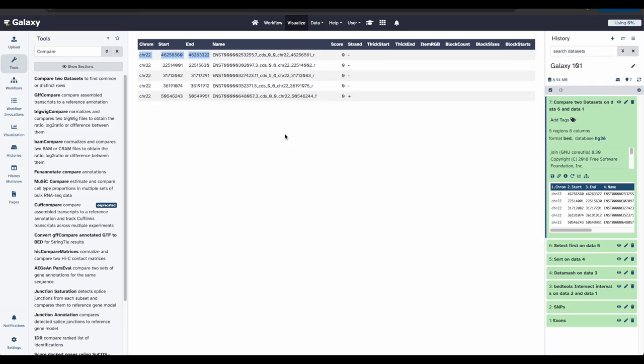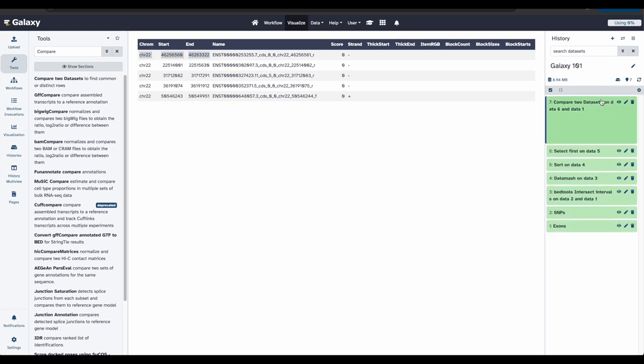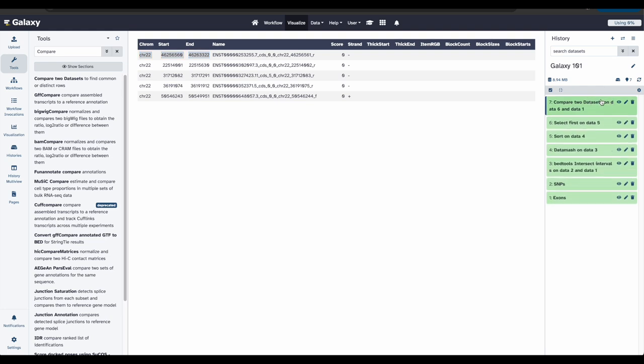In galaxy, your analyses live in the history such as your current one. Histories can be very large, and you can have as many histories as you want. When you look carefully at your history, you can see that it contains all the steps of your analysis from the beginning to the end. By building this history, we have actually built a complete record of our analysis with galaxy, preserving all parameter settings applied at every step.